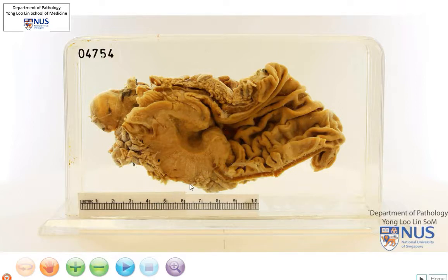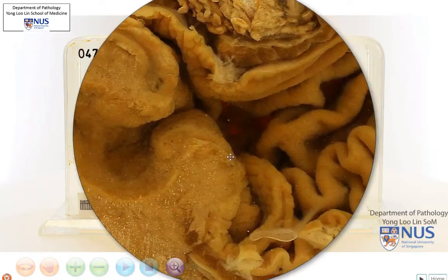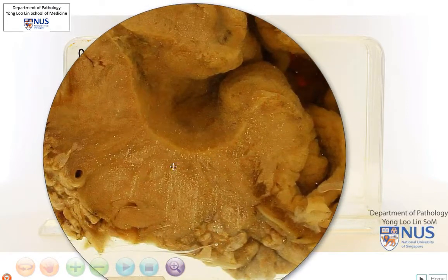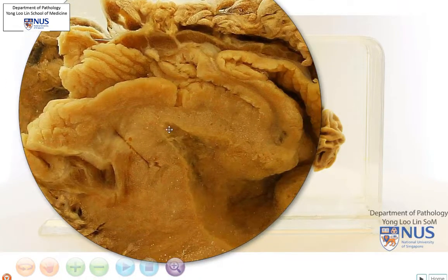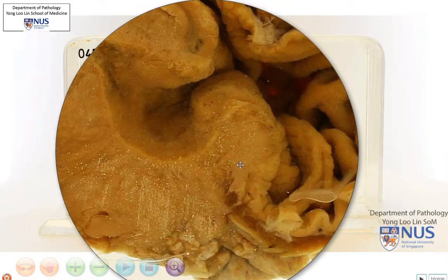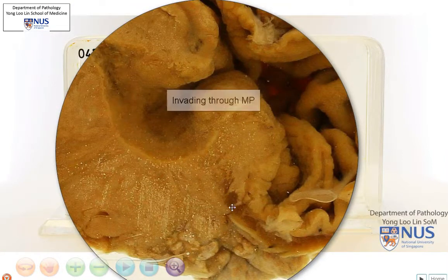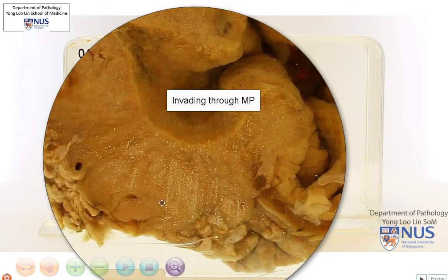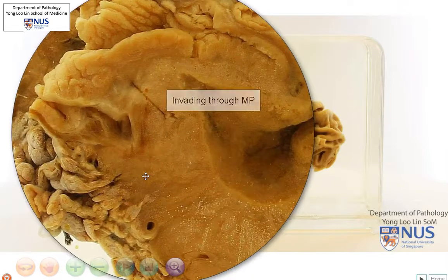We have a large fleshy ulcer at the antral region. The cut surface is pale tan and shows a rather smooth appearance, and we can see that the mass is actually invading through the muscularis propria right down into the subserosal fatty tissue.